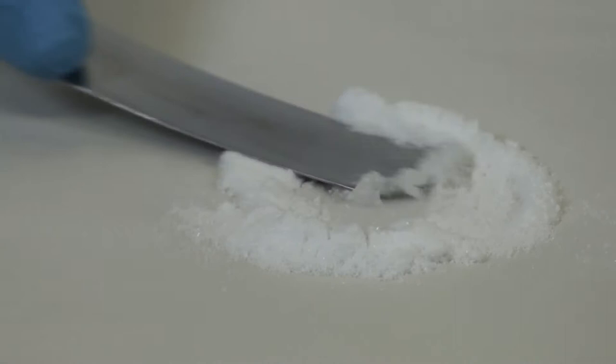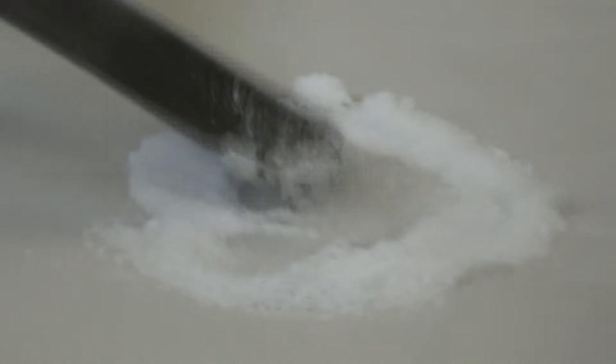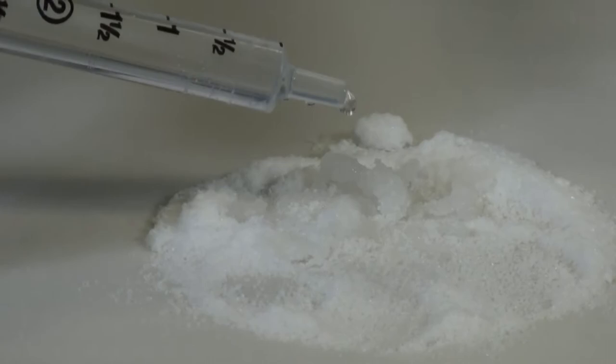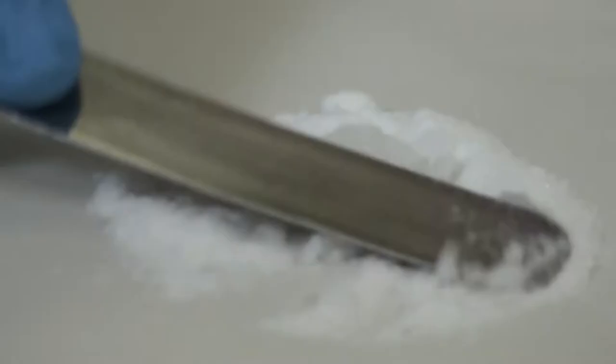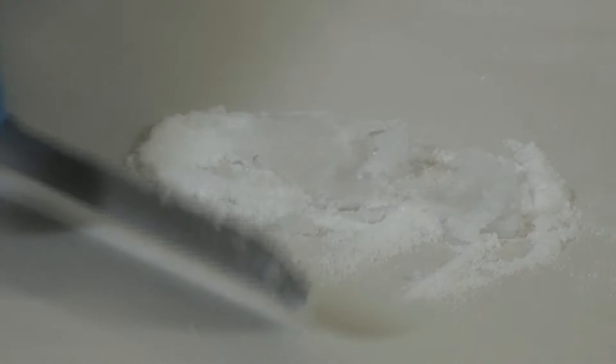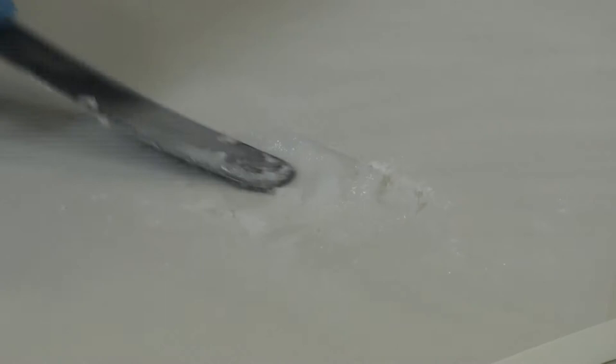What you're looking for is for the powder to be completely wet by the glycerin. So when you start seeing just dry powder flake off, go ahead and add some additional glycerin. You can gather in the paste you're making by using the flat side of the spatula. What you want is a thick paste, but you don't want any dry powder left that hasn't been wet. I think we're at a good stopping place.